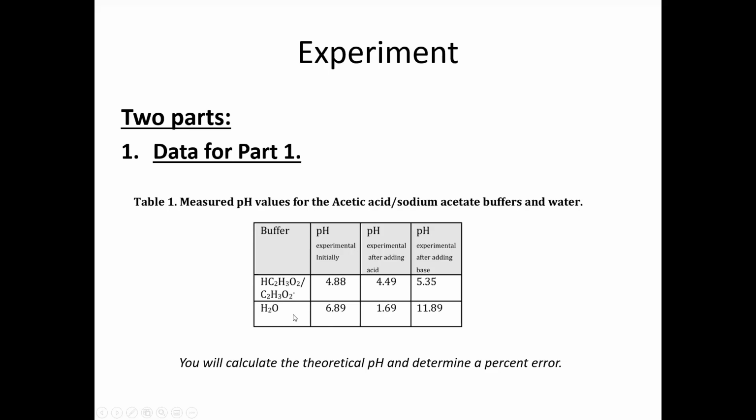However, when the water comes out of that tap, it gets in contact with the atmosphere. Carbon dioxide in the air, the carbon dioxide we breathe in and out, can be dissolved in water. That forms carbonic acid, so that makes the water a little bit acidic. You can see that, right?